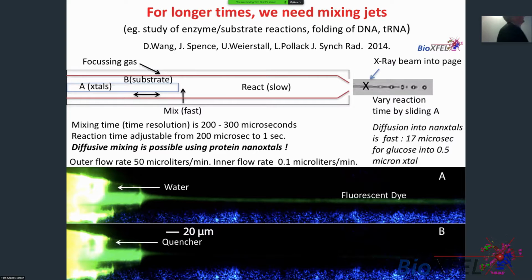If we think of a typical experiment where we mix a substrate with an enzyme, and the enzyme could be in the form of crystals, we can make a device like this, which was the Ph.D. work of my student. Much better versions have been made since in Nadia Zatsepin's group, in Cornell, in DESY. They haven't been published yet, but they're starting to work, and you'll hear results from that later. There are two new things about this. Previously, people had worked at synchrotrons with solutions in cells, so that's mixing cell work. Now, when you do X-ray diffraction at a synchrotron from a solution, it works, but it's called SAXS, and this will be fast, time-resolved, pump-probe SAXS. But it's poor resolution because you have to deal with the rotational averaging of all the species in the solution.